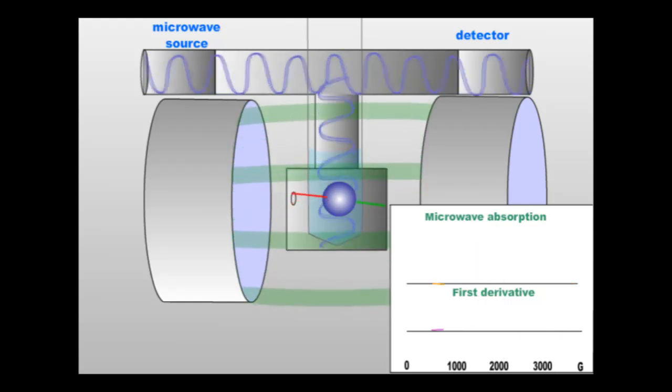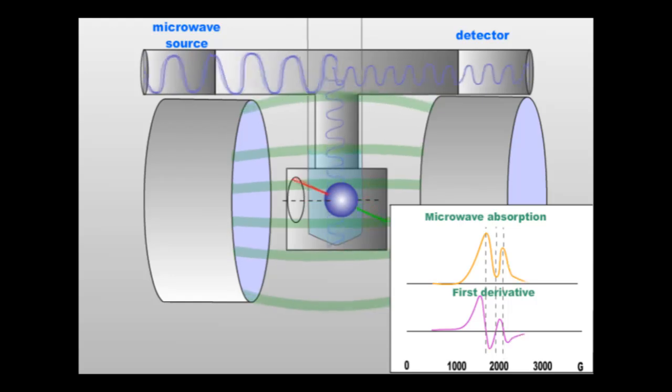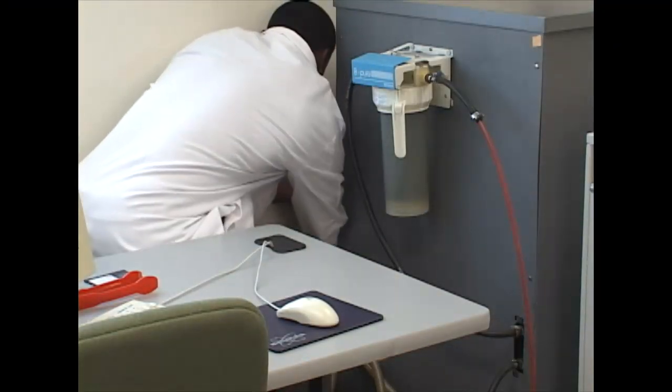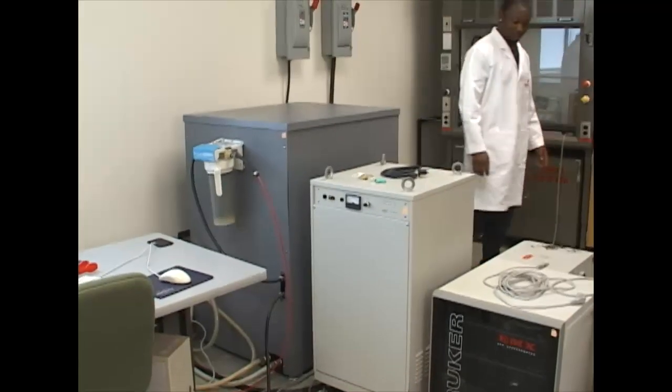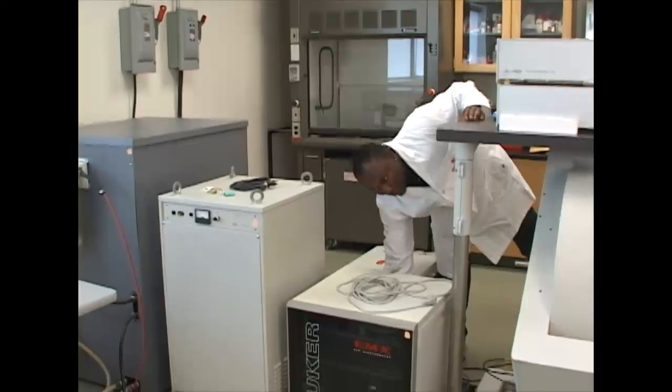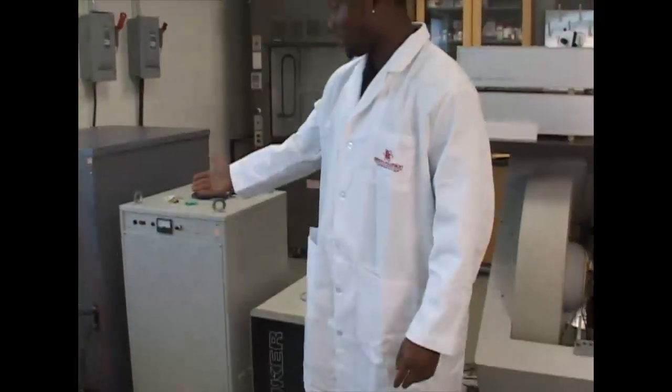The ESR machine automatically calculates the derivative of our sample. The first step is to turn the water on, then the heat exchanger, then the EMX, and finally the current control.